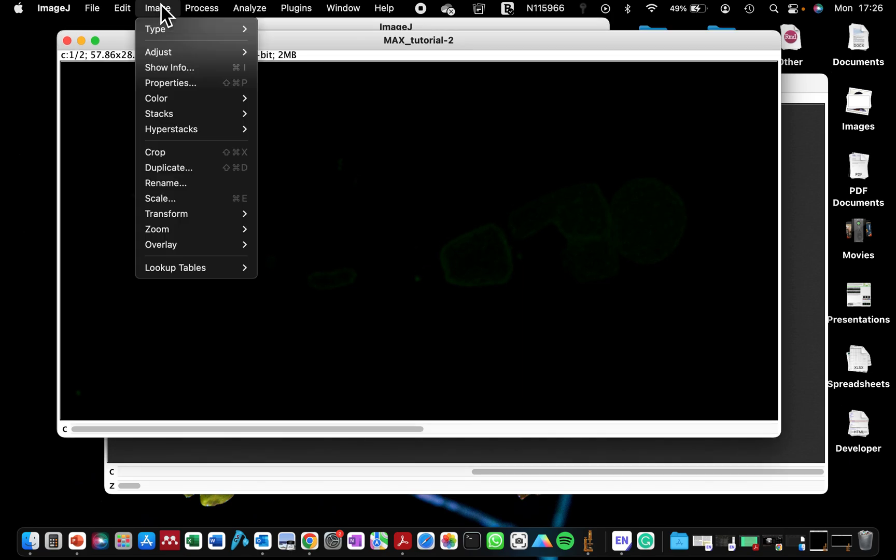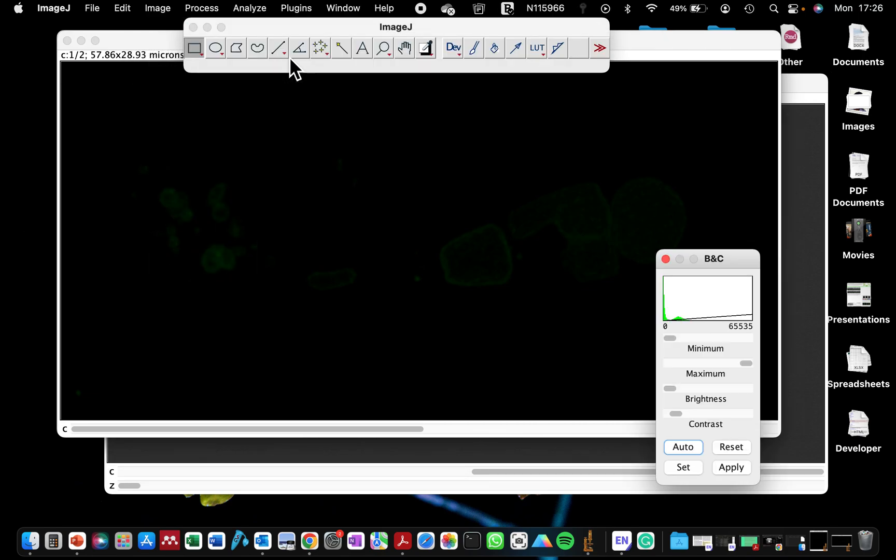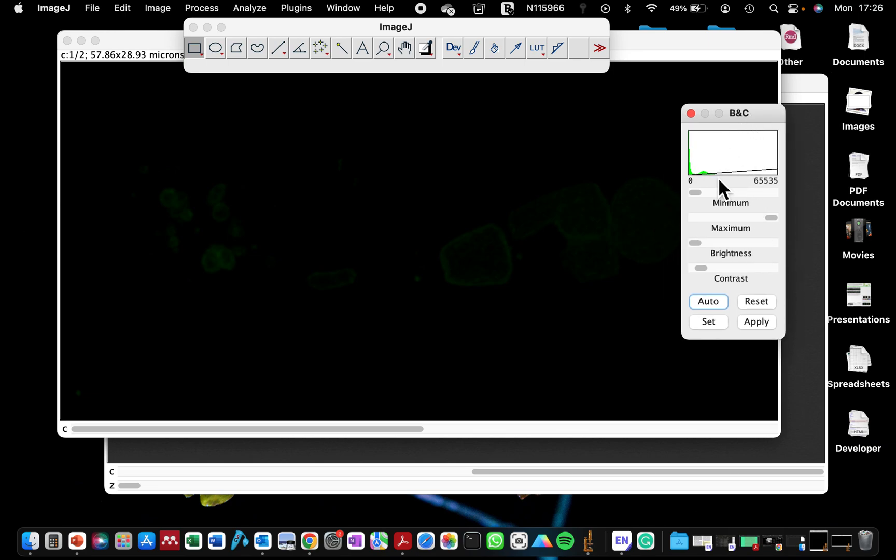So if you go to Image, you can actually go to Adjust Brightness and Contrast. So if you go there, this automatically opens this window.